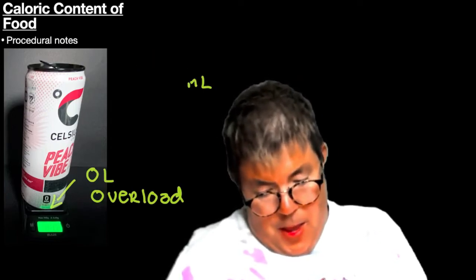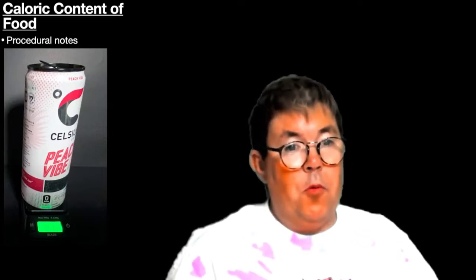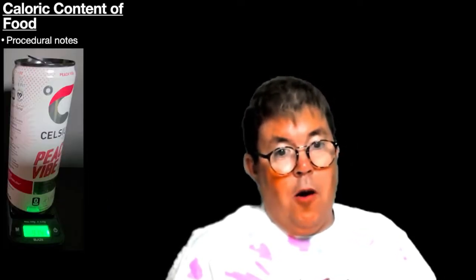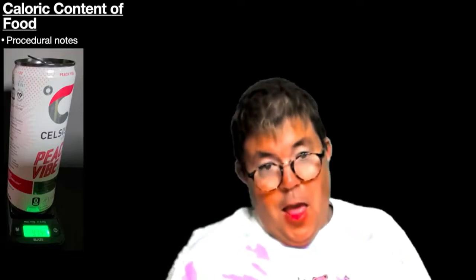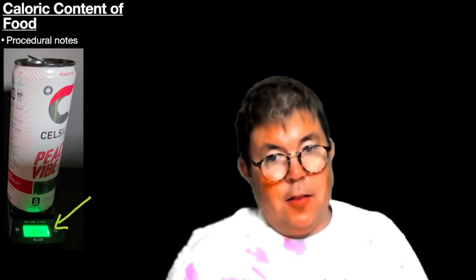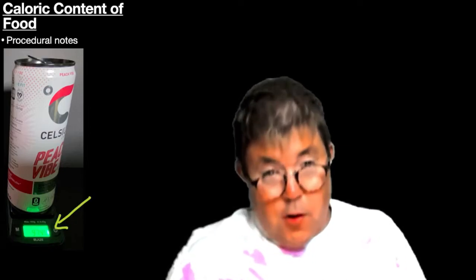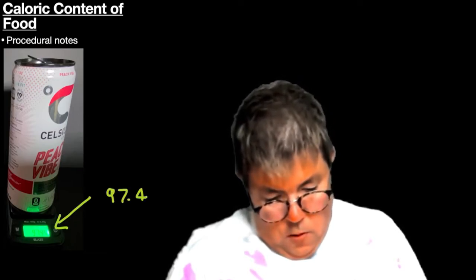So the weight being 100 grams is not important. What is important is that we know the actual weight in the can. And so if we look at the balance down here, it should be reading, let's see, very close to what? I think it reads 97.44 grams.